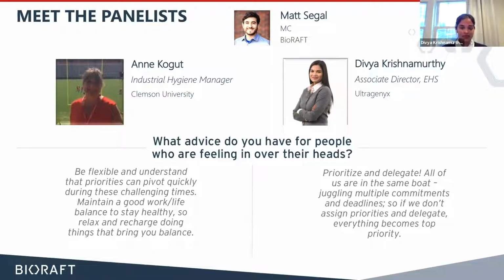And the way we've leveraged our work alone policy is that we came up with almost like a risk matrix, a reaction review matrix, if you will, to identify which ones are the highest risk and which ones use reagents that are high hazard, like highly hazardous. In addition to that, where it really helps is what scale people are doing that at. Limiting that scale perhaps so that it's not above a certain limit, and factoring those scales in our reaction review matrices.